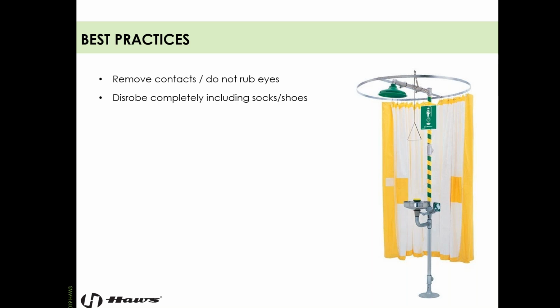Disrobe completely, including socks and shoes. The contaminants are running down your body. They're trapped in your clothing. You got to be removing that clothing as quickly as possible, and make sure to take off your socks and shoes. They'll get trapped in your shoes and do a lot of damage to your feet during an emergency, so make sure you're paying attention to that.